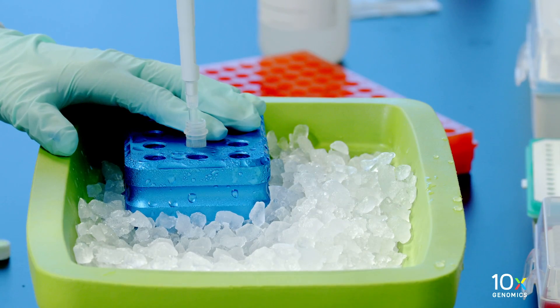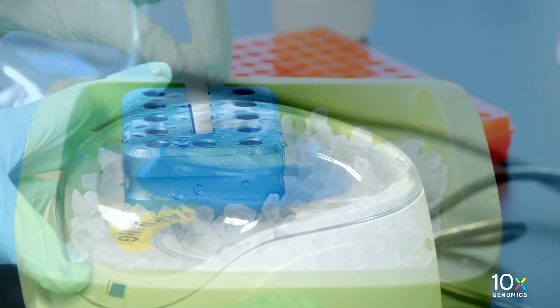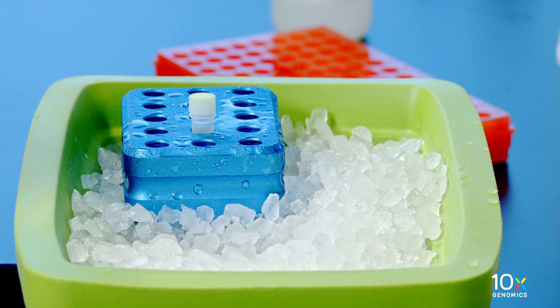Thaw the extension enzyme. Pipette mix, centrifuge briefly, and maintain on ice until ready to use.